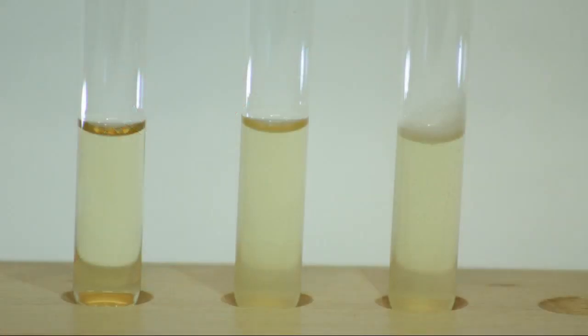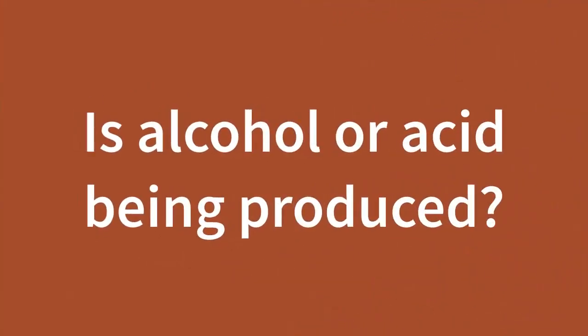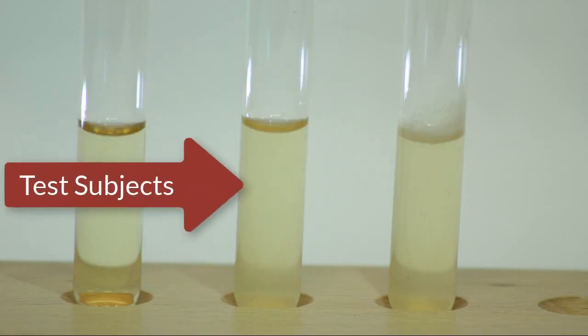The next test is the methyl red Voges-Proskauer test. This is a combination test that tests for the production of alcohol and acid. This is the methyl red portion of the test. The un-inoculated media is here, and you can see a couple of test subjects next to that.